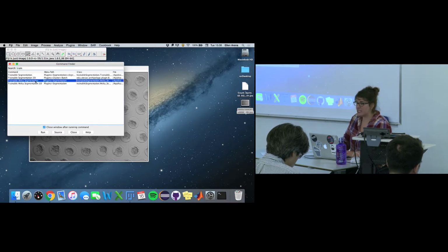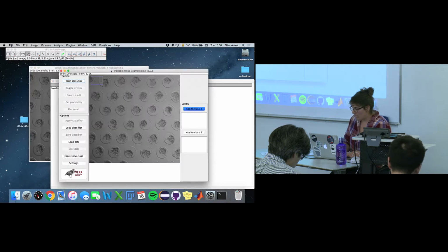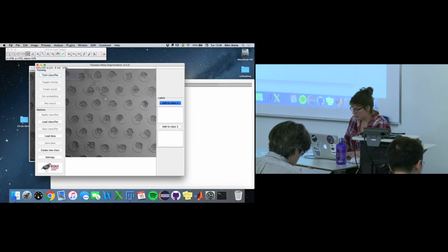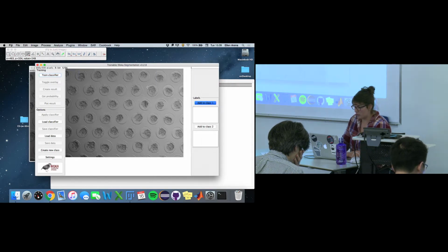The developer of this, Ignacio, is absolutely amazing. He did a fantastic job, and he's very active on the forum. So if you have questions, because this tool is really user-friendly, but it does take a little bit of effort because it's so powerful. And again, you can just zoom in and out just like you would with a normal image.